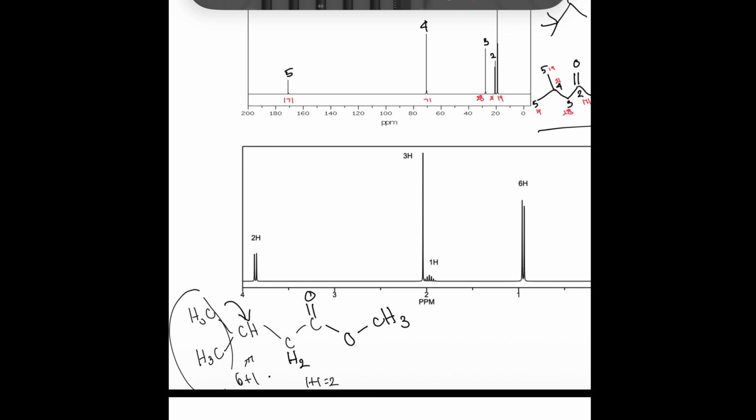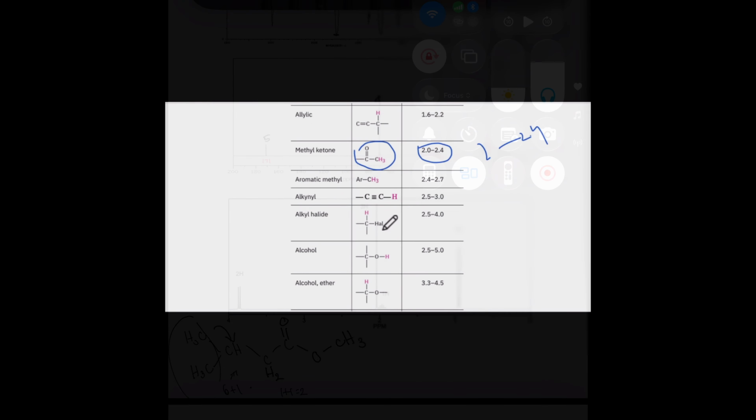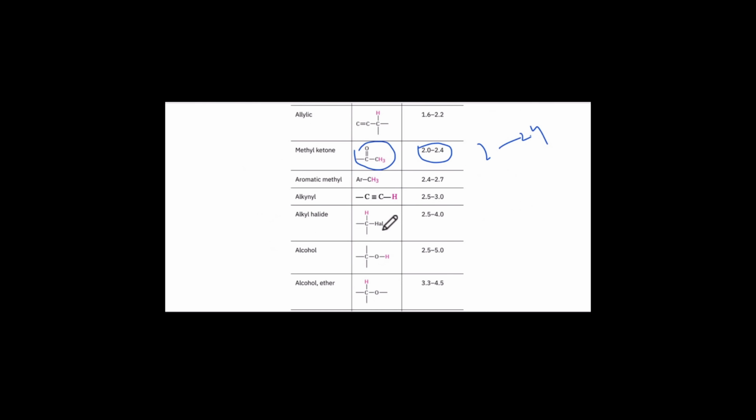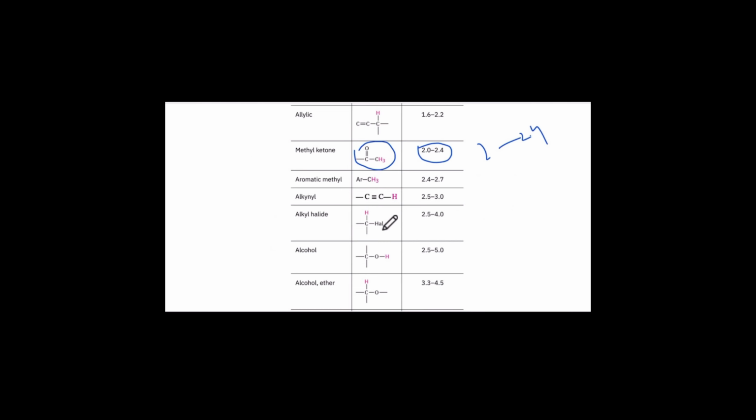In this structure, the third carbon here would have to be in that 2 to 2.4 ppm range. So if we refer to this table, we can see which functional group should be in the range of around 3.8, where it shows on the spectrum. We see that with the atoms that we have, we can use this for reference.